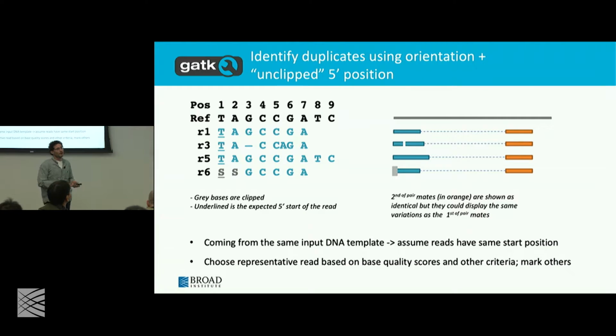Okay? So randomly matching your position without being a duplicate is not very likely for paired end. It's a little bit more likely for single-ended, right? So for single-ended reads, especially at high depth, you might get a lot of random, not artifactual, duplication. And there you have to ask yourself the question, do I want to mark duplicates or not? We don't tend to deal with single-ended reads so much.